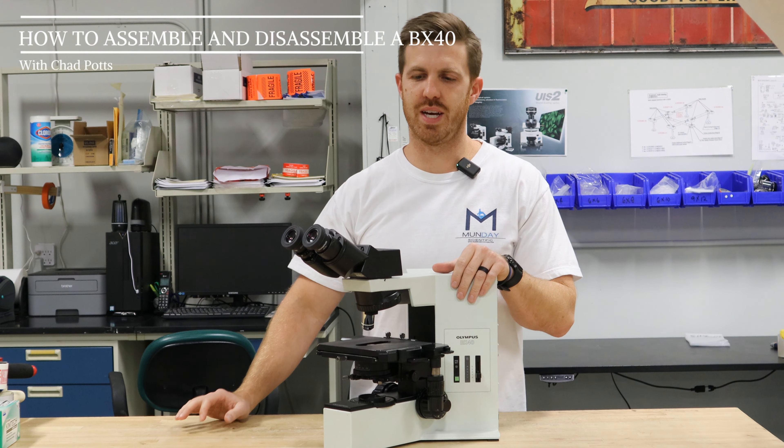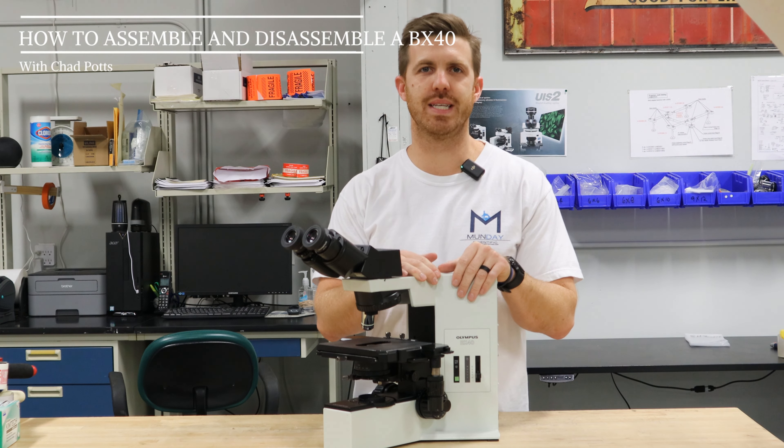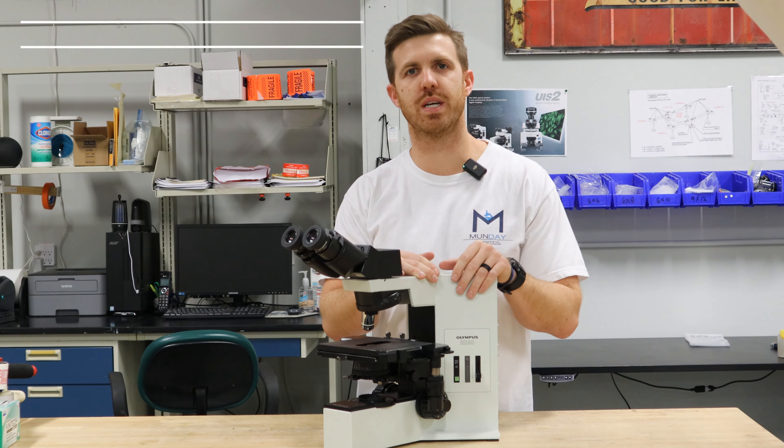Hey, this is Chad with Monday Scientific. Today we're going to show you how to assemble and disassemble an Olympus BX40 microscope.